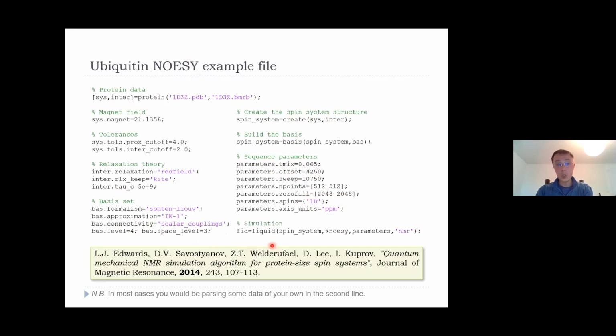And then that's it. So we call the context called liquid, which sets up internally all the data structures required for liquid state NMR simulation, builds the associated pulse, detect, and so on operators. So that's our spin system. That's the pre-programmed NOESY sequence. It's already there. These are the parameters, nothing beyond what you would have told the spectrometer. Assumption set NMR.